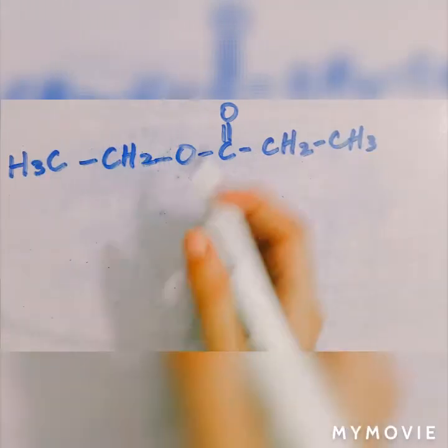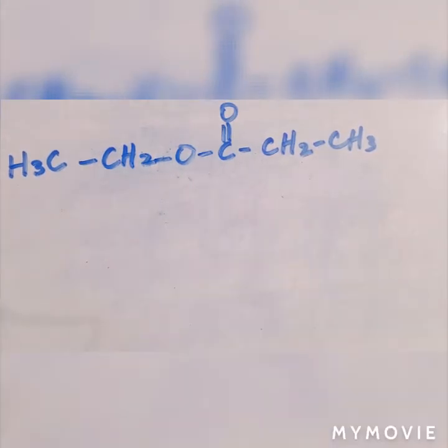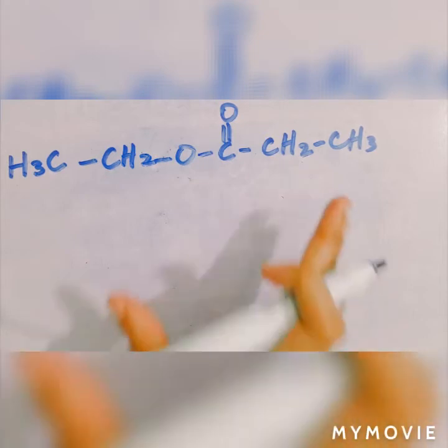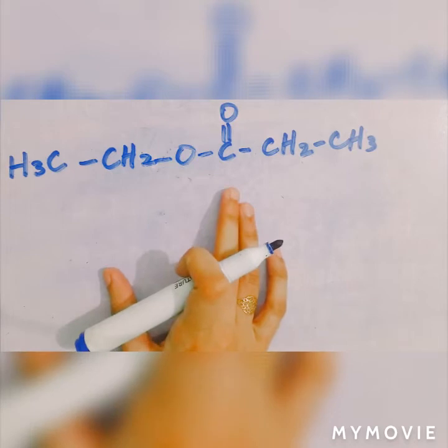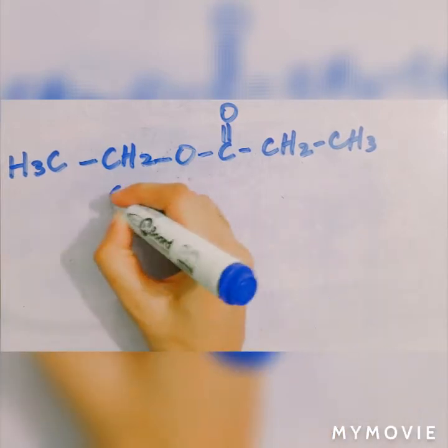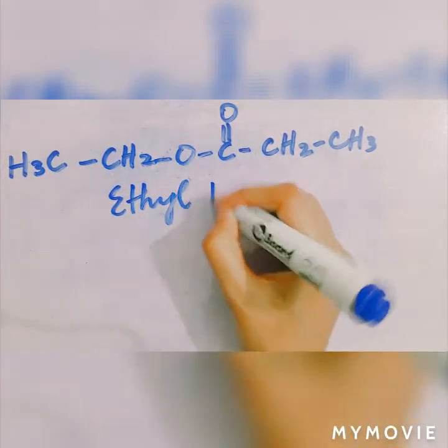Hello students. In today's class, we will discuss how we can identify the types of protons in a molecule at first sight, and what things we must keep in mind while looking at a molecule in case of proton NMR. For example, here is a molecule of ethyl propanoate.